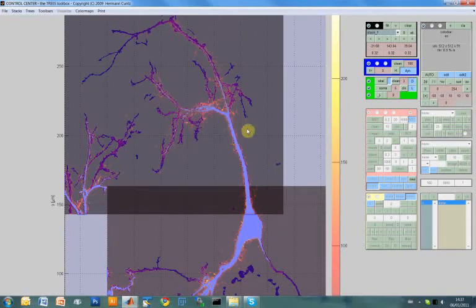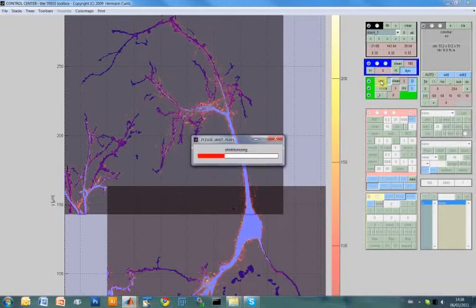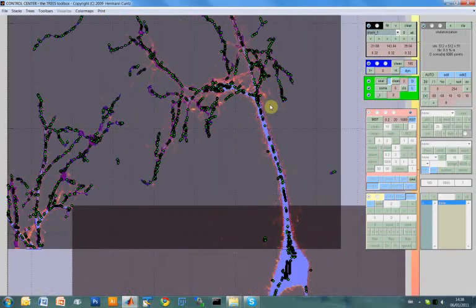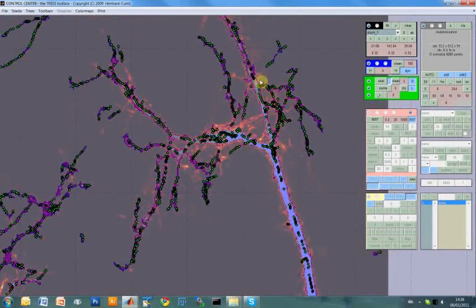The next point is to skeletonize this thresholded image. That's in this skeletonization panel, this green panel here. There's the skeletonize button, which is just the first step of the skeletonization process, and you just have to press it, and you will see how this results in the carrier points of this thresholded image. So that's also done individually for each image stack, but you see that these green points lie on the morphology, and they are sort of the carrier points on which we will grow the tree.